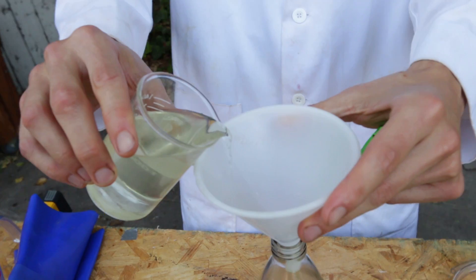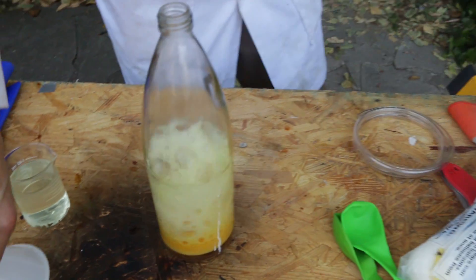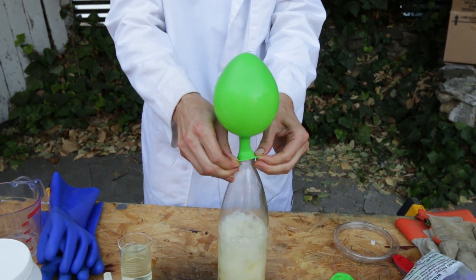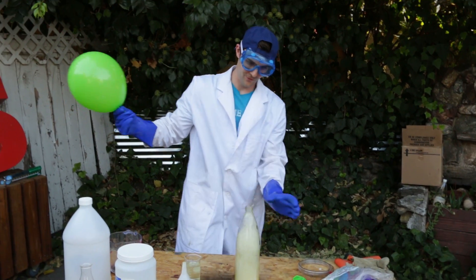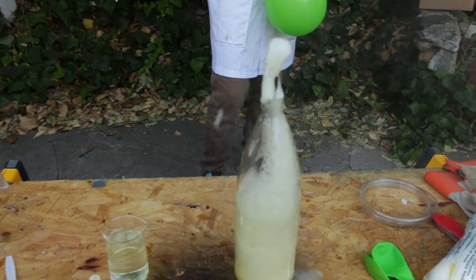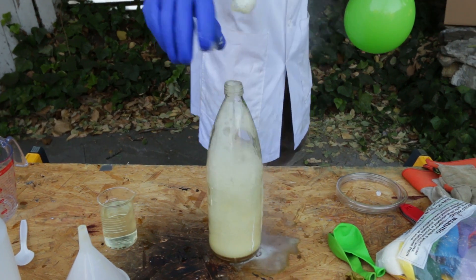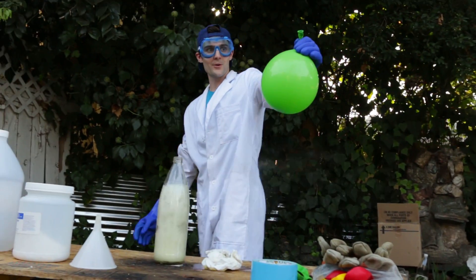I'm going to go slow. Not too much. Whoa, that's a lot. The reaction happens so fast. Getting a little fizz over there — didn't take much. Getting crazy. There's one way you get a lot of oxygen gas very quickly, and right here is a bunch of oxygen gas.